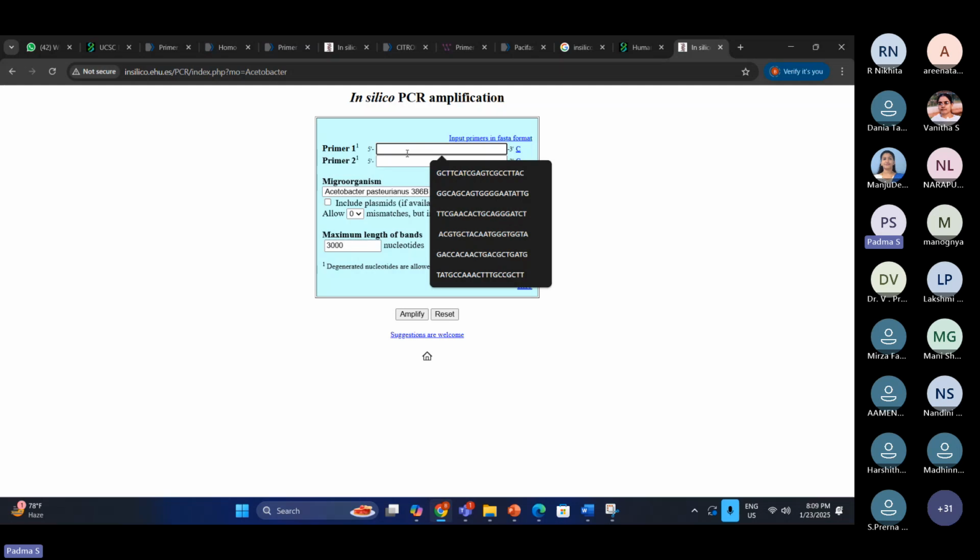To choose your gene of interest in that organism, first identify the gene which is there in that particular organism, and then you put that gene into your Primer3 program, and the Primer3 program will design the primers, as we have seen in the Primer3 program.